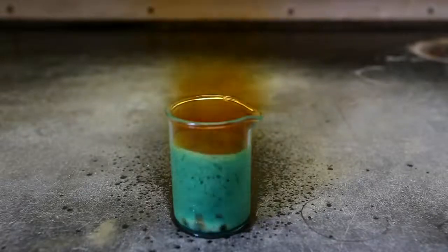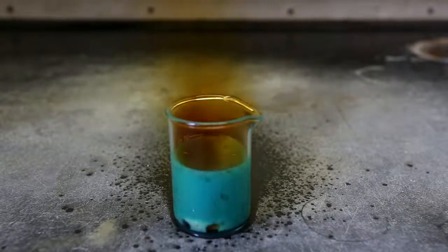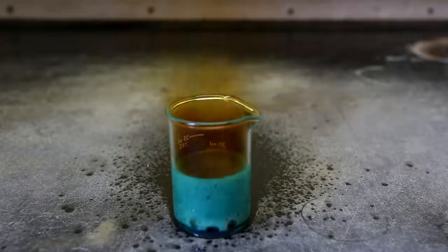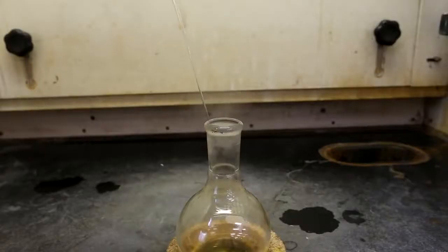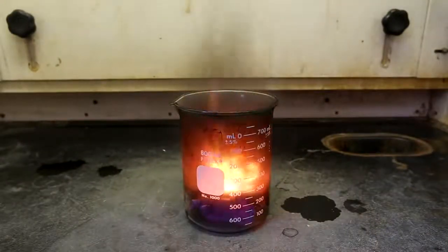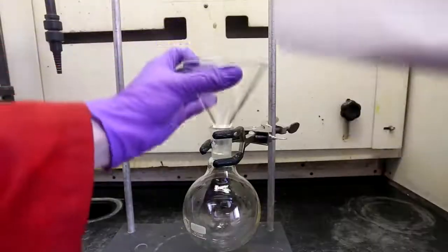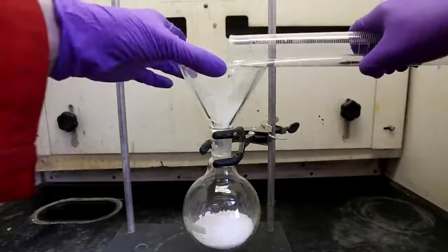Commercially available nitric acid is usually around 68%, whereas fuming nitric acid is greater than 86% nitric acid. The uses of fuming nitric acid are rather limited compared to conventional 68% nitric acid. One interesting use is as an oxidizer in liquid-fueled rockets. However, in organic chemistry, fuming nitric acid has the main use of producing highly nitrated compounds.